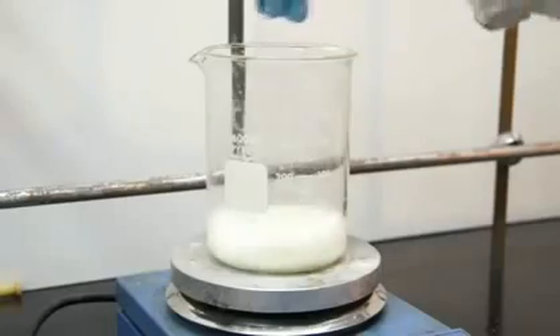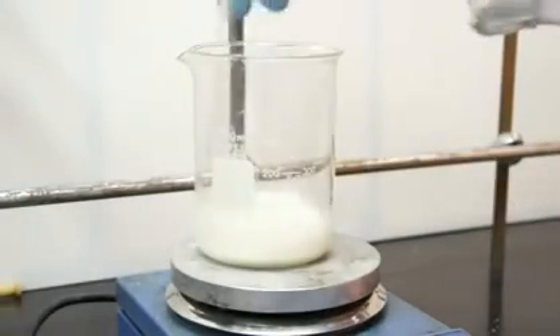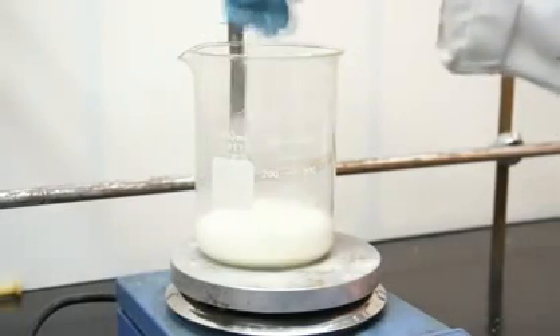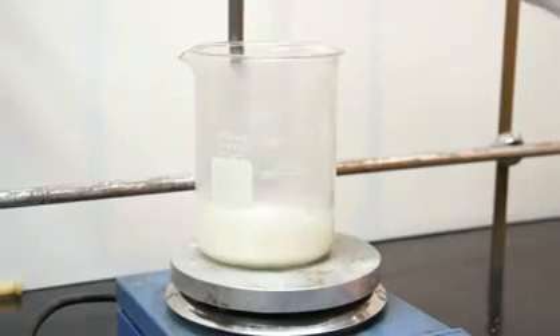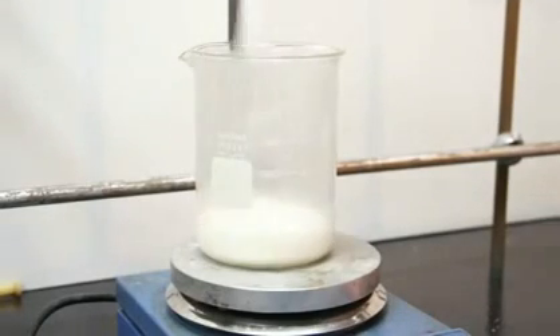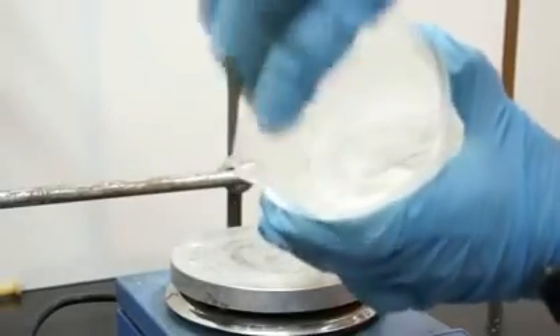Now turn on your heat and start stirring like crazy. Now what's the chemistry that's actually happening inside that beaker? Starches are polysaccharides, or large branched polymer chains consisting of sugar molecules. As you heat the mixture, the acetic acid hydrolyzes, or breaks the bonds between the branches, and this leaves you with long linear chains of polysaccharides, or sugars.